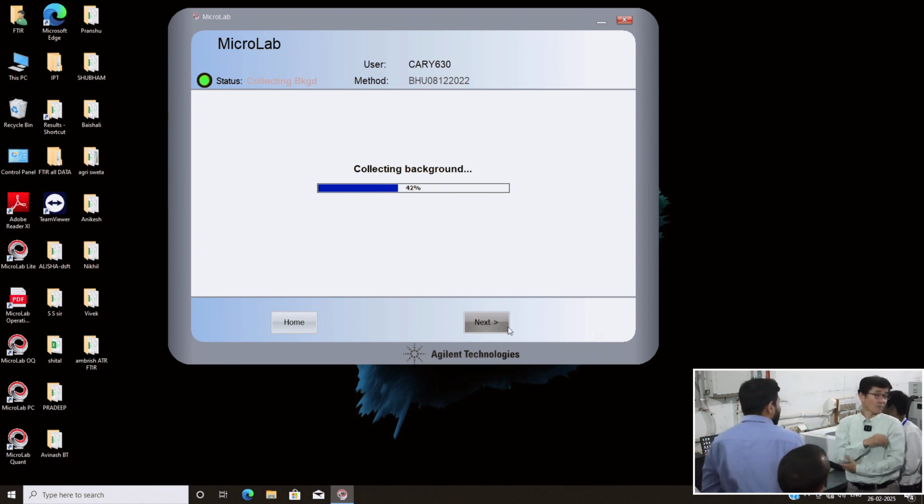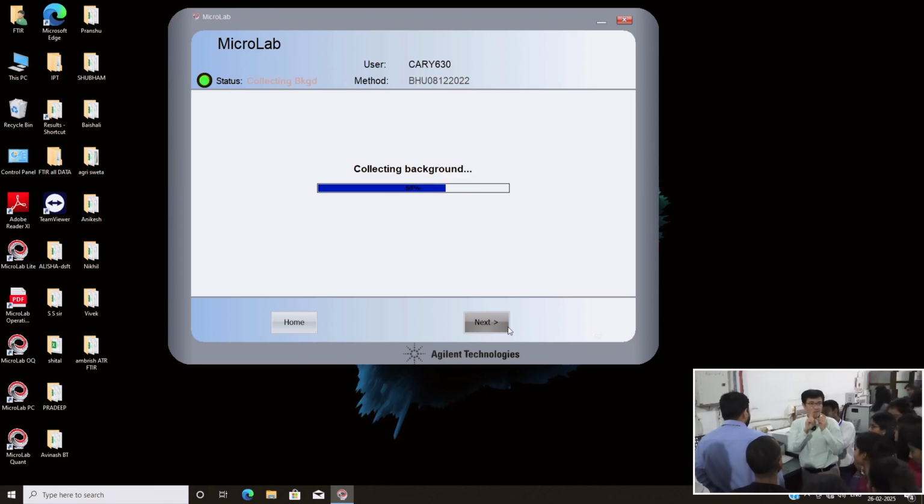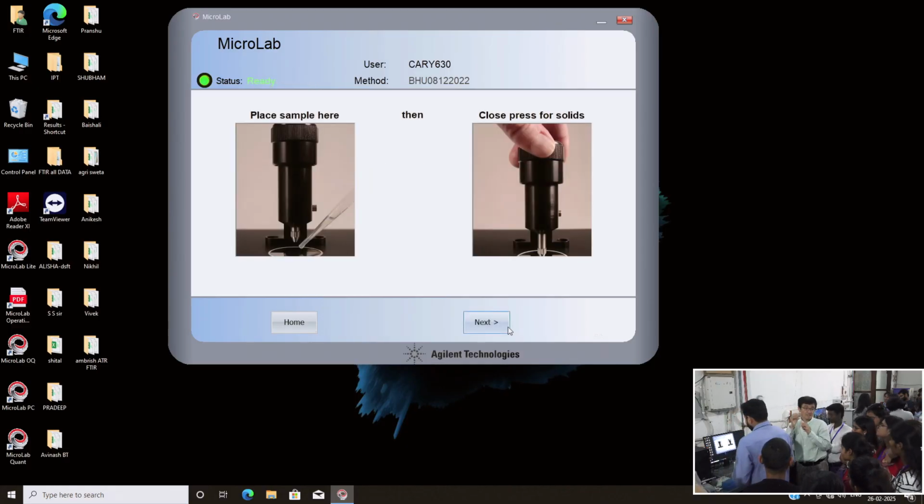So this measurement consists of two measurements. One is the measurement of the water spectrum, the solvent spectrum. The other is the measurement of the solution spectrum. Usually we measure the solvent spectrum by scanning twice. The first scan is the measurement of I0 without sample.